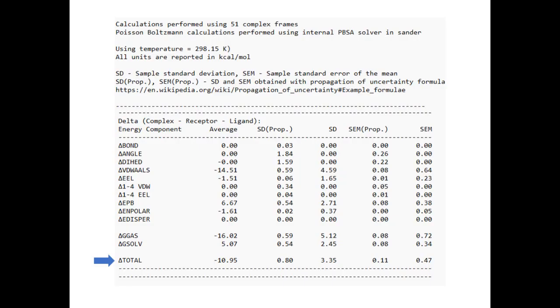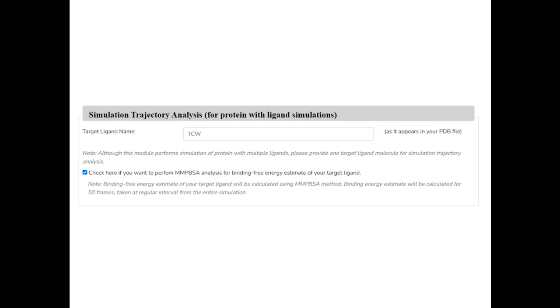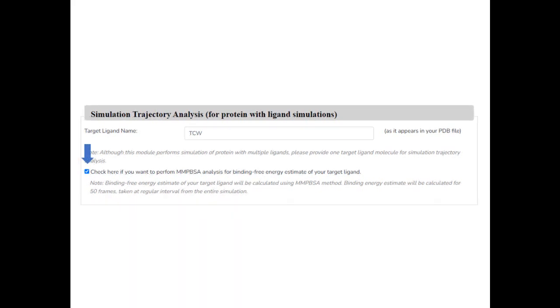SI BioLeads MD simulation module has inbuilt functionality to perform MMPBSA-based binding energy calculations for your target ligand. Therefore, if you want to perform GIBS binding free calculation for your target ligand using MMPBSA method, check the MMPBSA box.